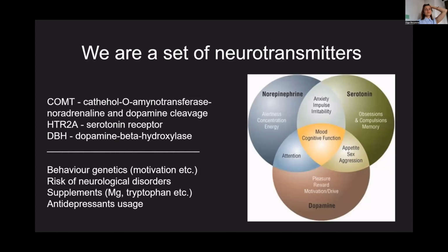And actually, folate metabolism genes are very popular in different commercial sets of analysis. Some of them are quite expensive. They will just tell you that they will reveal your folate metabolism or methylation status, etc. And actually, you can do it easily just by analyzing a few genes. You have a list of them, by uploading the filter and just looking at the information from OpenCravat.